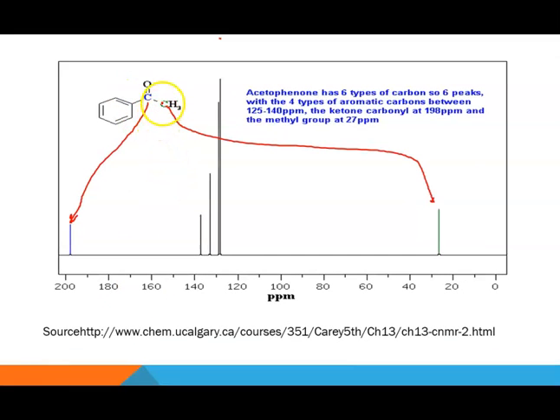Now we can go to the right here and look at the CH3 group. We just saw this in the previous slide where this carbon surrounded by hydrogens is what we call insulated. But we have to remember too that this green carbon, if you can see it, is still influenced by this oxygen in the same proximity.